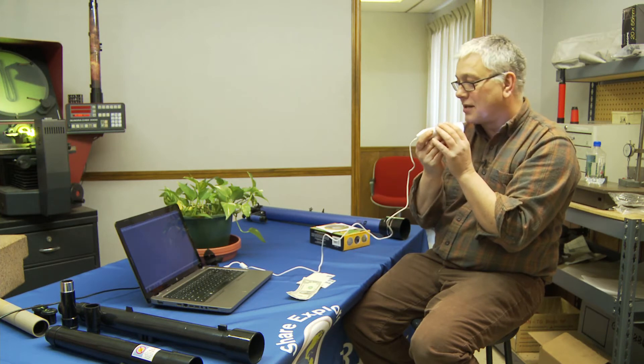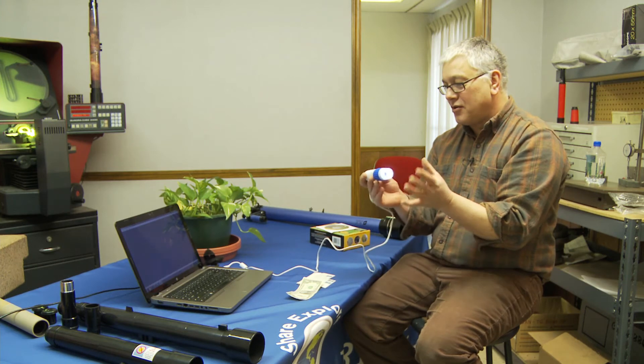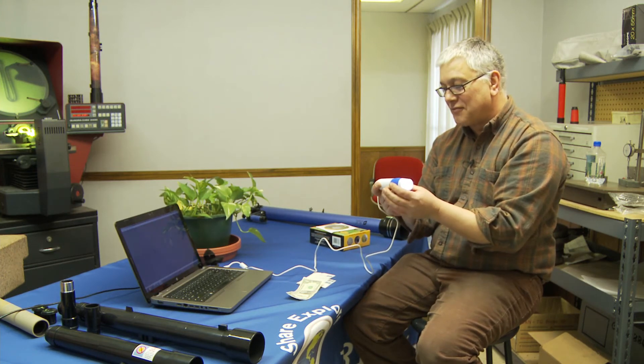Kind of gross, kind of cool. Looks like a big piece of cauliflower that's kind of got juice in it. But there's a lot of things to be learned from things like that.